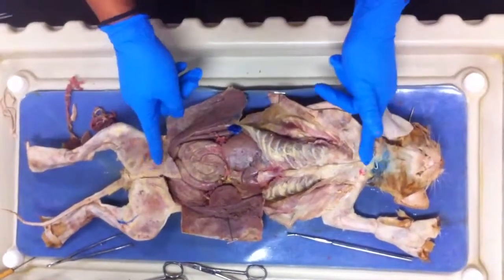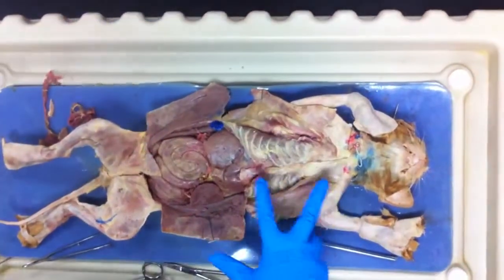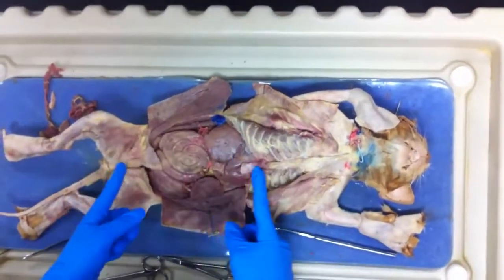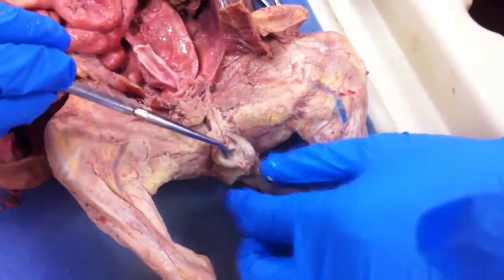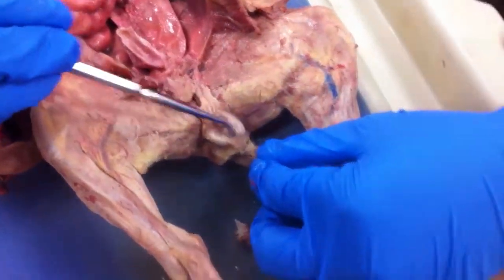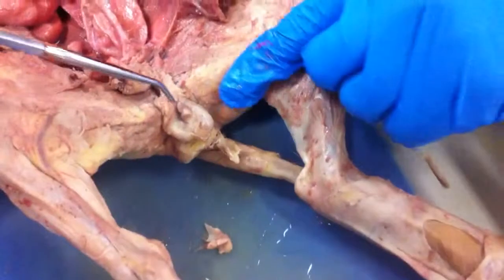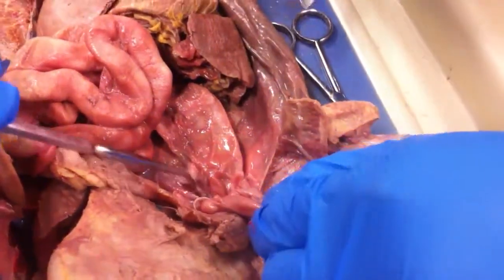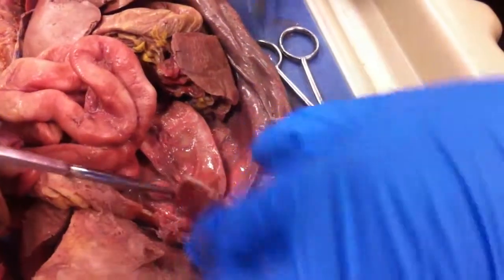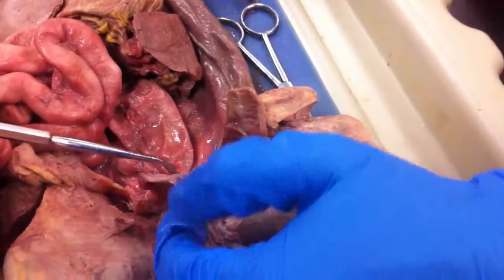One long cavity from the neck to the penis is called a coelomic cavity, which separates into two cavities. This is the thoracic cavity, and this is the abdominal pelvic cavity. This right here is the gonads. It consists of two testicles. They are used in sperm production. You can see a tube that leads up to the penis, which is then connected to the urethra, which is back here. And then this little sac right here is the bladder.